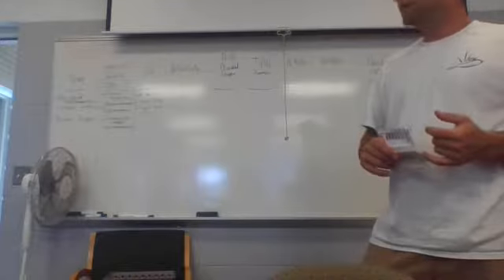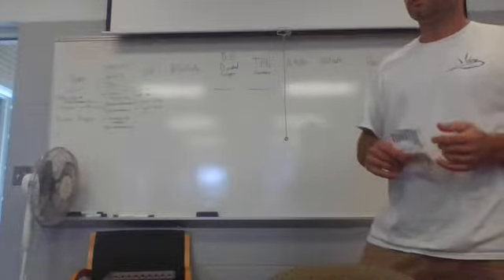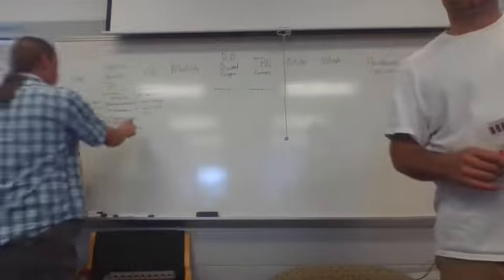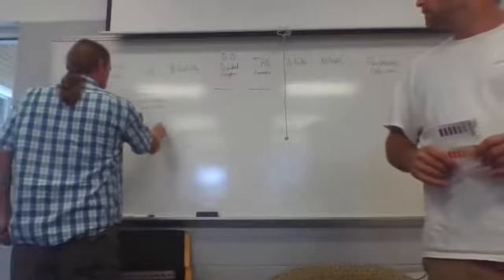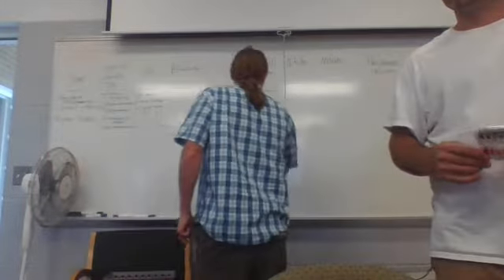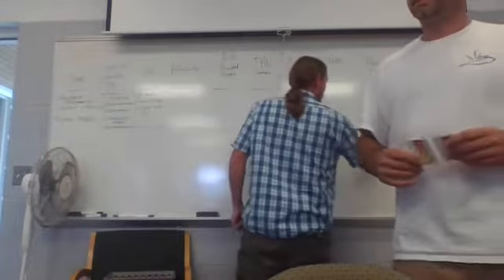Any other for pH? Spectrophotometer. Just going to draw an arrow out here, because you can use the spectrophotometer for pretty well everything, pretty much everything on this whole list.